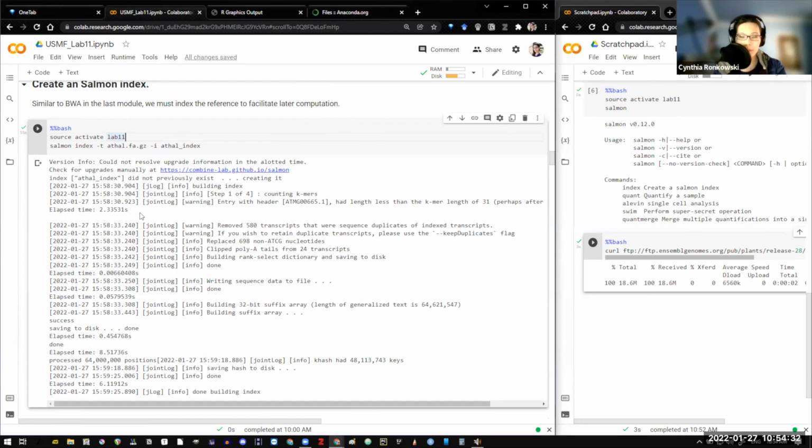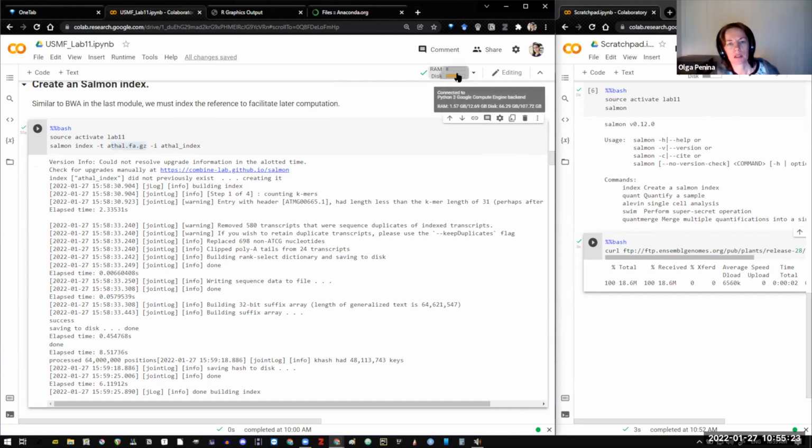Yes. Okay. And if we use just FASTA but not compressed, we need to change some flags, I think, or do we just need these options? So we need to look at the options depending on which input file we have as a reference transcriptome, FASTA or compressed. You won't need to change this option specifically because it'll recognize either a FASTA file or a compressed FASTA file, and both will work. Both will work. Yes. Okay. Just the compressed version is preferred because, as you can see already, we're running a bit low-ish in terms of disk space on Colab.